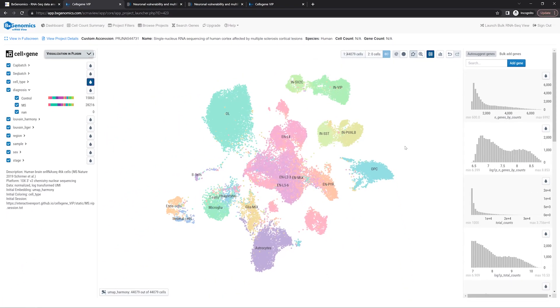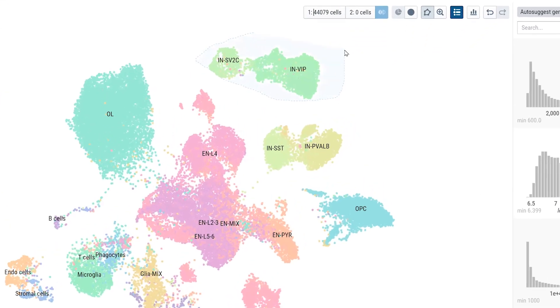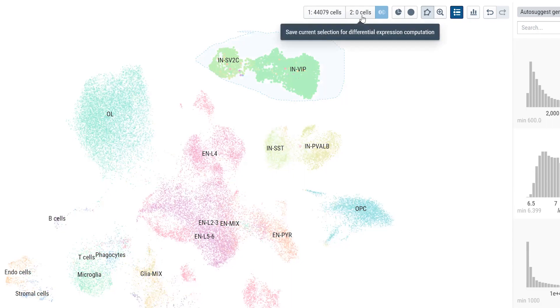Another way to select cells is to use the mouse to draw a shape. Here, I'll select the two inhibitory neuron clusters at the top right corner, and when the drawing turns from blue to green, the selection is complete. I can save these neurons to cell slot 2 and make plots from these cells if needed.